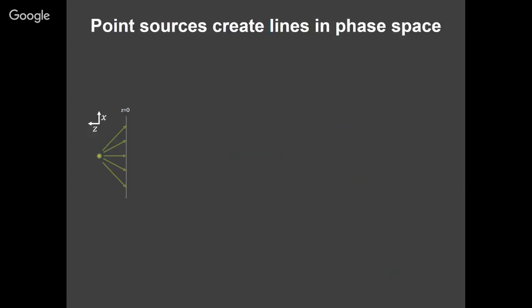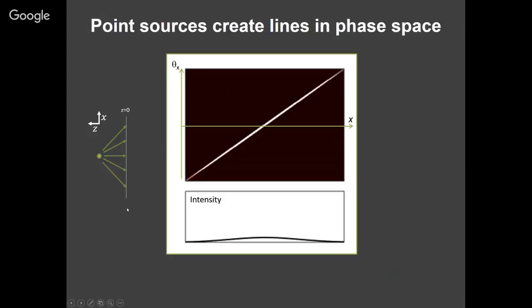that light up. So if I have a single point source, and say I care about the light field at this particular plane z equals 0, and I've got this point source that's at some different depth. So this is the axial dimension here, and this is lateral. If I plot x, theta x for this point source, it's off focus, and so it's giving off light in all possible directions.